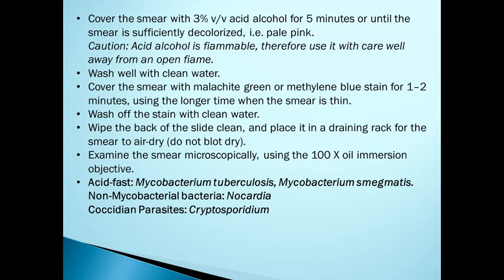Cover the smear with malachite green or methylene blue, that is the counter stain, for 1 or 2 minutes, using the longer time when the smear is thin. Wash off the stain with clean water. Wipe the back of the slide and place it in a draining rack for the smear to air dry. Examine the smear microscopically using the 100x oil immersion objective.